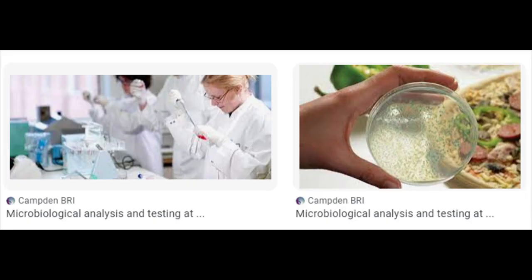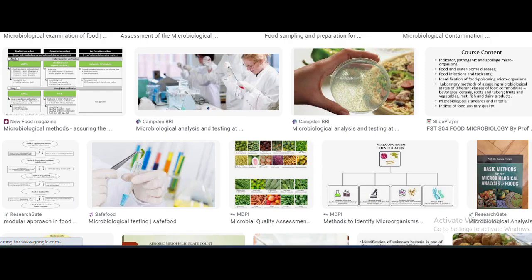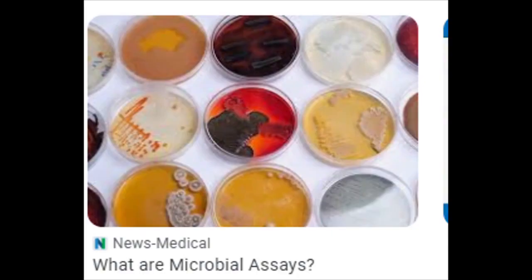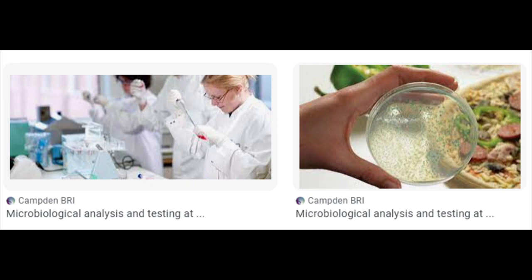The way you will examine water is different from the way you examine fruits, and it's different from the way you examine rice or beans in terms of the microbiology. The way you examine cooked rice is different from the way you examine uncooked rice. So these are some of the things we're going to look at today. But let me just say that I want to talk about laboratory methods.